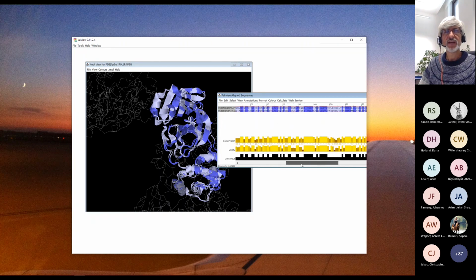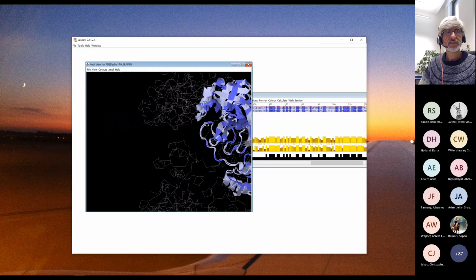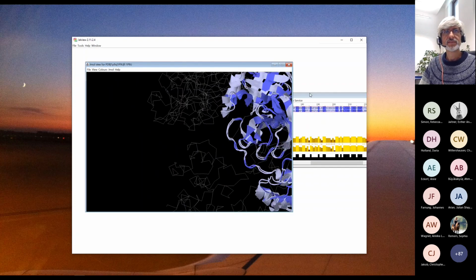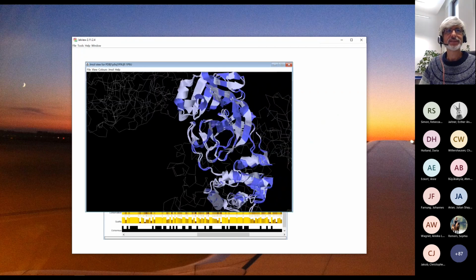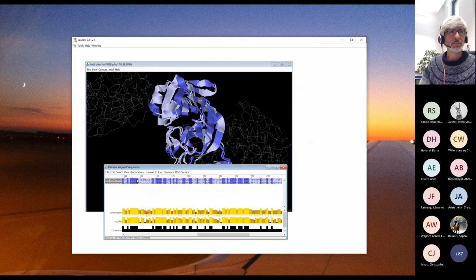And now we can go to the cysteine 141. Okay, I'm here in the PEAK one. I have to move this because it's on the other side. The window is a bit difficult. It would be easier if I removed the other chains, but that will take a bit of time and I don't want to do that. So anyway, if I point to the cysteine, okay, yeah, this is better. So I'm turning this, and I go to the cysteine in the PEAK one.